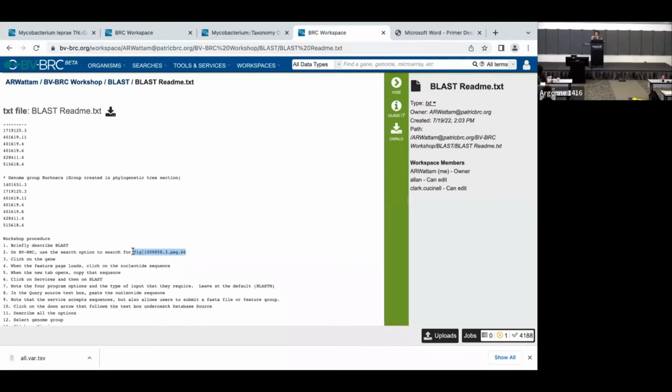So I'm using this purely for demonstration purposes to show you how you can do the different selections in what we provide for BLAST so that you can look at things. And it's also for the cautionary tale, right? Like I tell you, oh, it says that you don't have a gene in this protein family. Don't publish upon that until you do a BLAST and verify that it's actually missing, especially if it's a really important gene, because the reviewer is going to do that. So you don't want to be caught out on that.